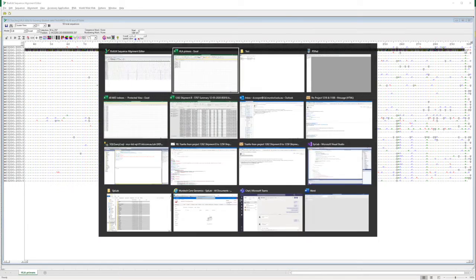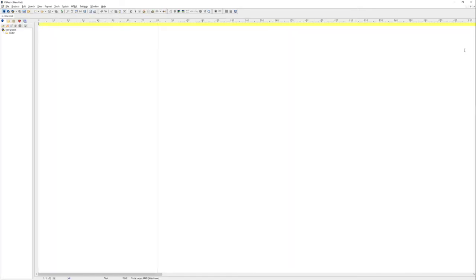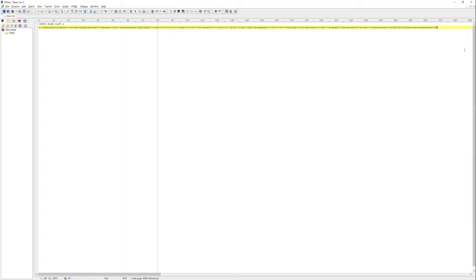We then go to our text editor, start a new file, and we're going to make FASTA sequences for each of these consensuses. So a FASTA sequence starts with a greater than sign and then the name of the read. So this is mid2, HLA-B, exon 2, forward, and I'm just going to denote this one with an A for the first of our 2 consensuses and paste that in.